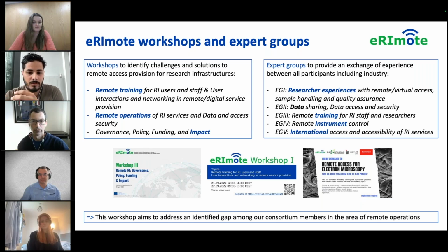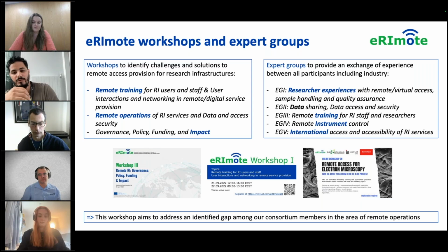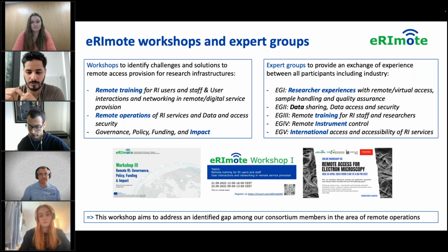We have also been organizing a series of cross-domain experts group meetings on different thematics, but always related to remote access, such as researcher experience, data training, remote instrument control, and international access. All documents and recordings that were generated from these events are openly available on the eRImote online information platform. I will also put the link in the chat.